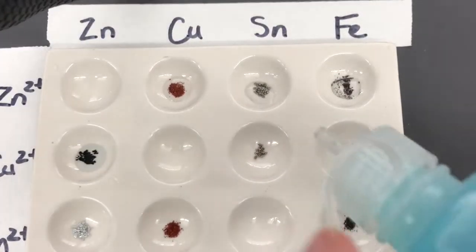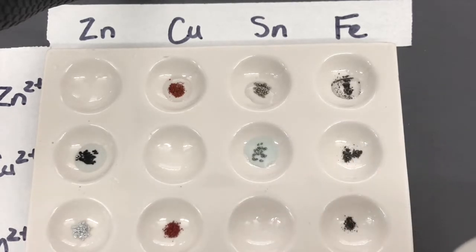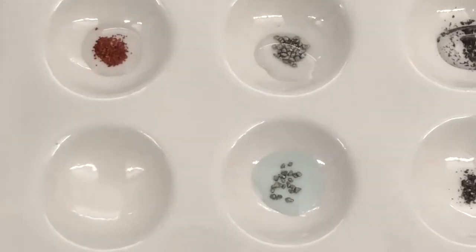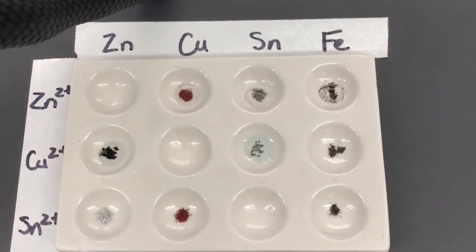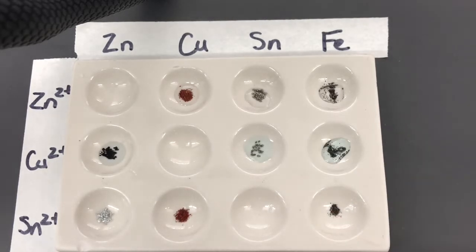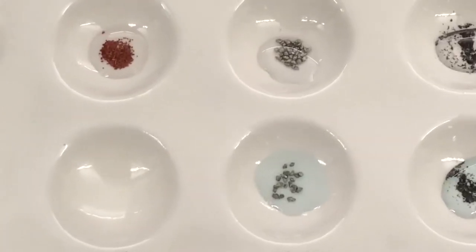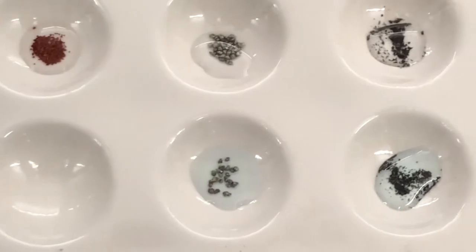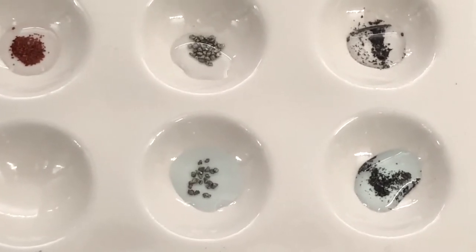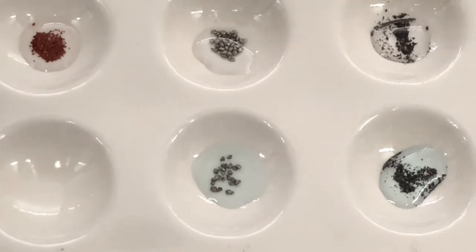So we're going to add some copper 2+ to tin. I'll add 2 drops. Again, the initial observation appears to be nothing reacting. You can still see the shiny metal. For the next reaction, we're going to add copper 2+ to the iron. And let me zoom in so you can see what's happening. The initial observation is there doesn't appear to be a lot happening, but again, we'll go back to that one in a while and see if we see any changes occurring.